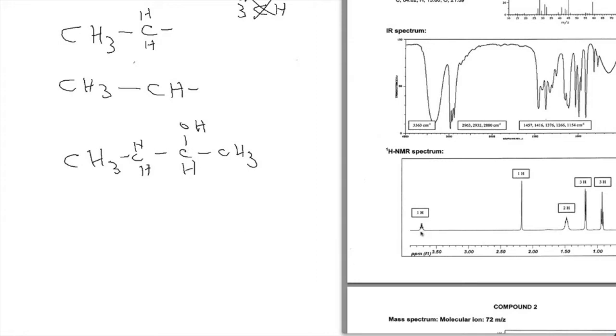That tends to make the splitting difficult to interpret when you're between two different types of carbons. How about this splitting? Can we tell what this splitting is? This is hard for me to see as well. It's hard to see the little peaks on the end, so the splitting here is probably too complicated to be helpful. So you have to use judgment. Here, the splitting is a clear triplet, and here it's a clear doublet. So in these two cases, the splitting was helpful. But when the splitting gets too complicated, sometimes you can't rely on it too much.